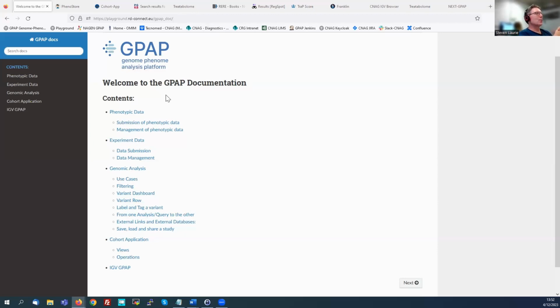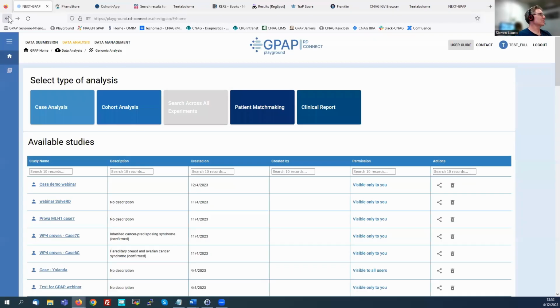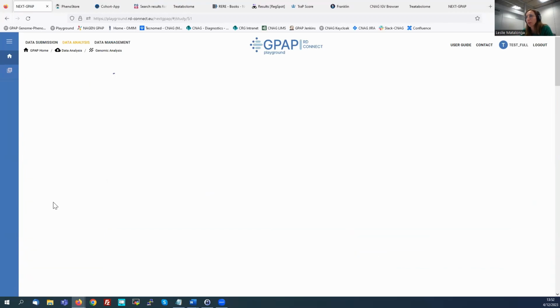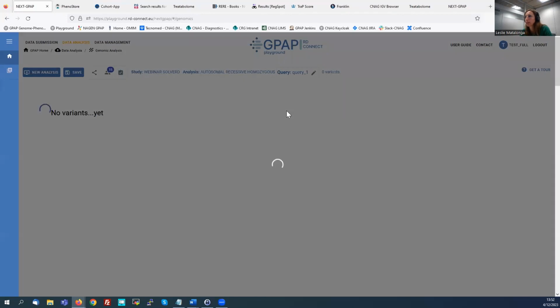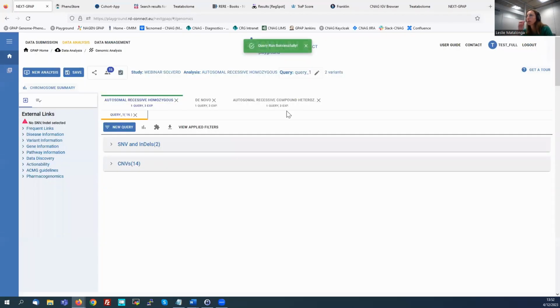Kieran has a question. Can we save our custom variant filters apart from the preloaded ones? And I would also ask, can we share our custom variant filters? You cannot share them, but you can save them. I will show you how. So now I'm loading the study we were working on.